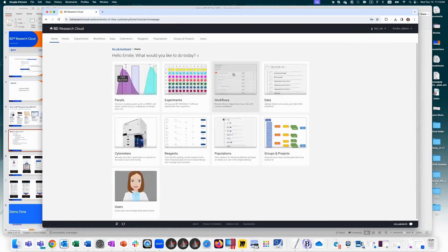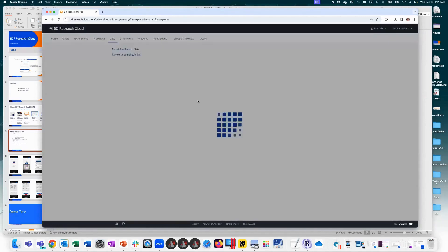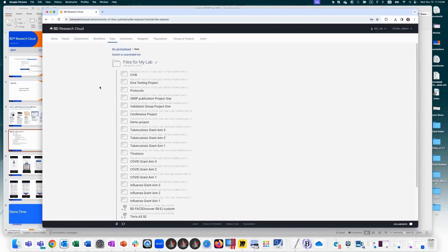Next is the data section. You can upload data directly into workflows or store it in the data management tool. The structure within BDRC is that you create groups within your organization, and people in those groups have access to data within those groups. You can have multiple groups, assign people to different groups, and control who has access to what data.